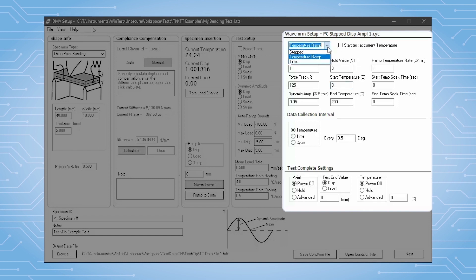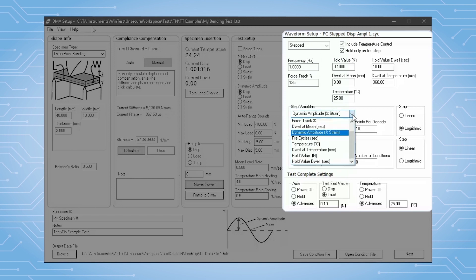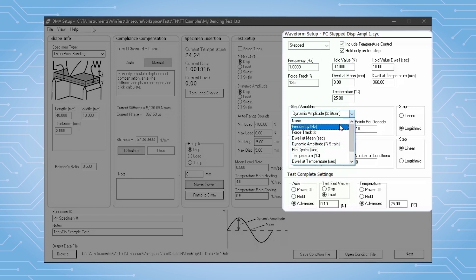In a step test, you build a series of conditions by defining a change of one or two variables. Examples are a strain sweep test, a frequency sweep, or a nested frequency and temperature test.